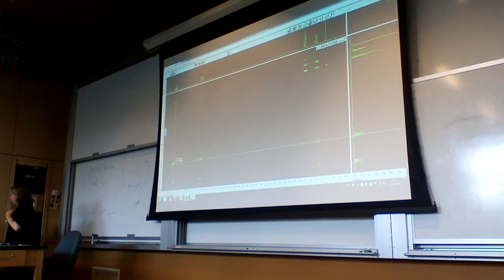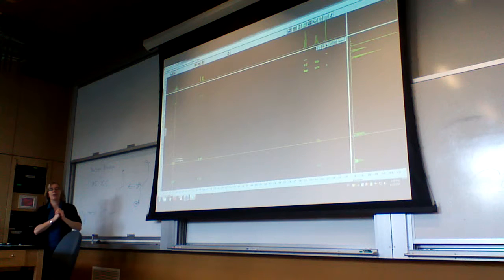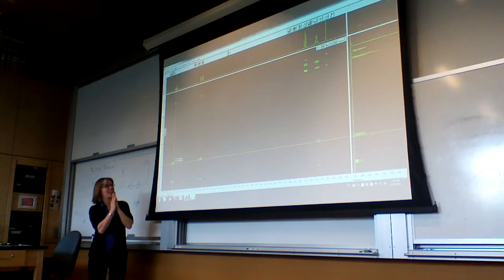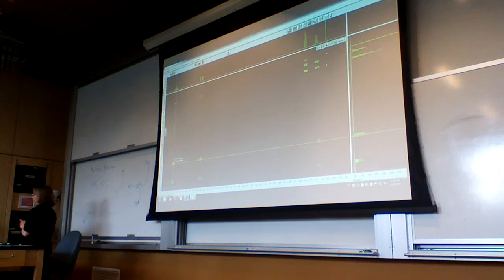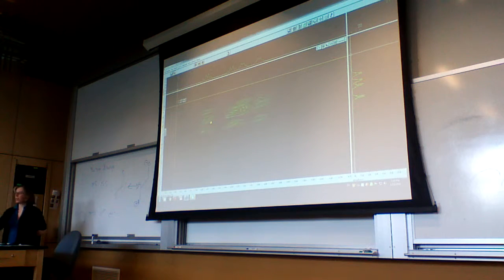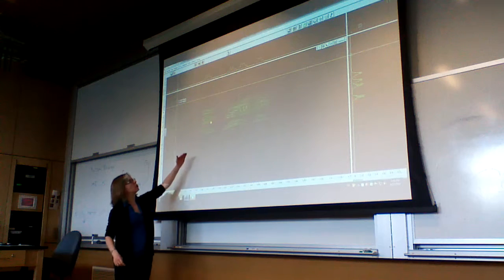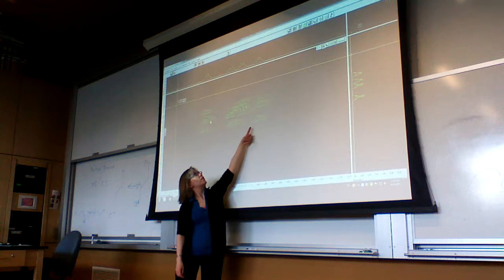The last coupling that we have in here is actually a little bit more tricky to see. When you have two peaks that are really close together, and they are coupling one another, they are very close to the diagonal, but not quite on the diagonal. So if we look at this set of peaks right here, I'm going to zoom in on these. You'll see we've got our two peaks for F and E, and we do have the diagonal peak here and there, but we've got these side peaks.